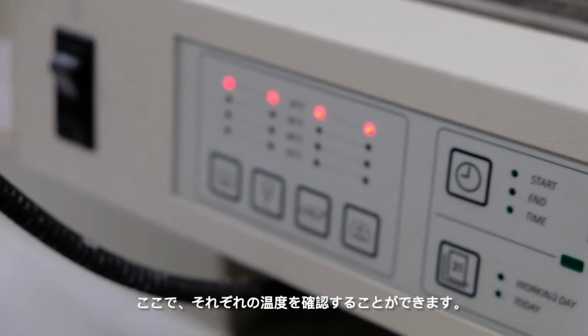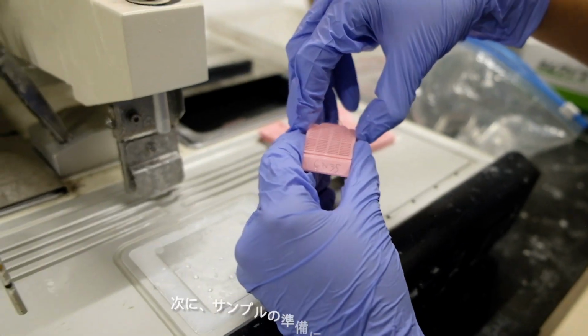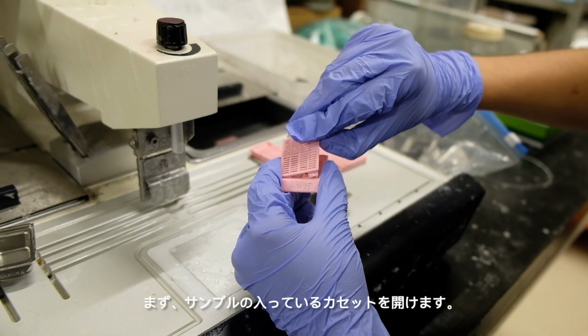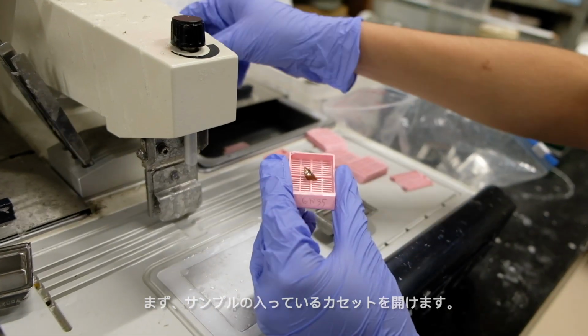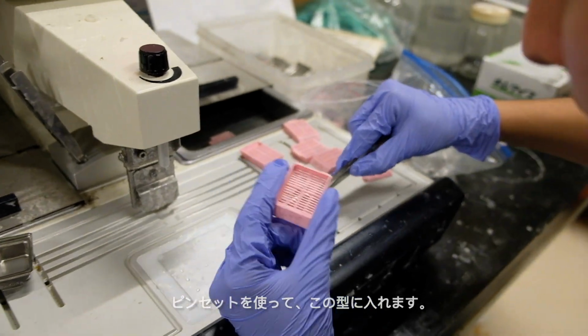And here you can see the temperature that it is heated to. Next, we can start to prepare our samples. So first we want to open the cassette where we have our sample. We'll use the tweezers to take the sample and put it in this mold.